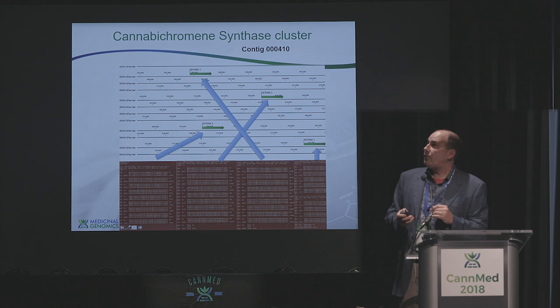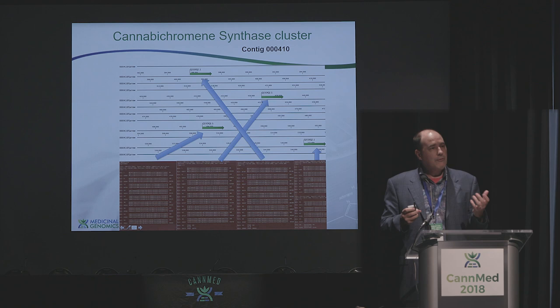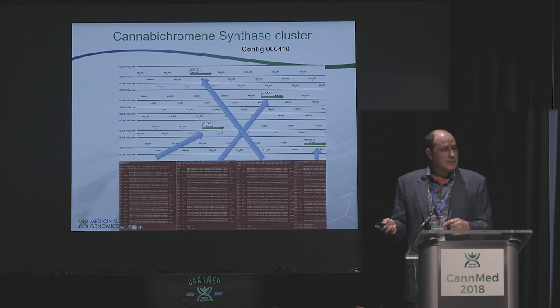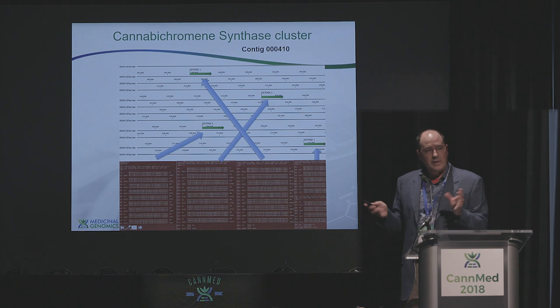And then likewise, you can look at another contig that is the one that contains cannabichromene synthase. Now we know that this thing actually is four tandem copies, about 30 or 40 kb apart. And you probably can't see this, but there are some mutations in the 3' end and the 5' end that change the amino acid structure such that primers probably missed this in the past because they would have been placed on those sequences. There happen to be two more copies of this in another contig in the genome that's now been linked by the Hi-C data.